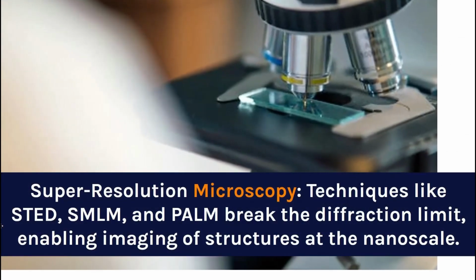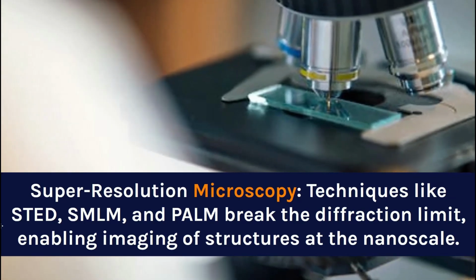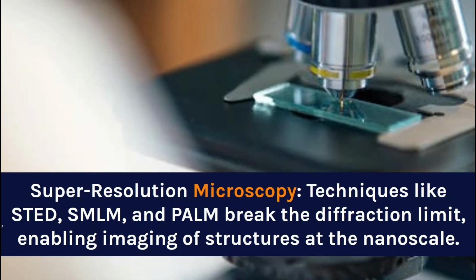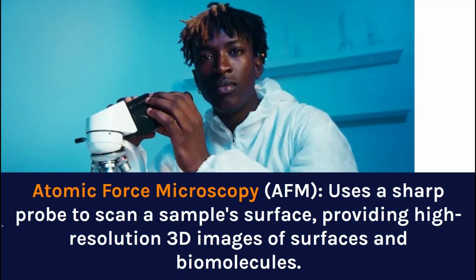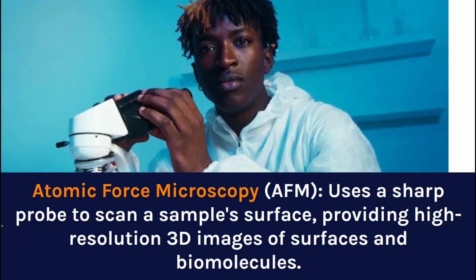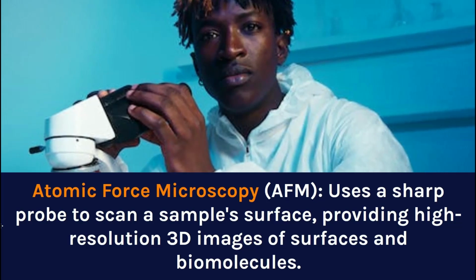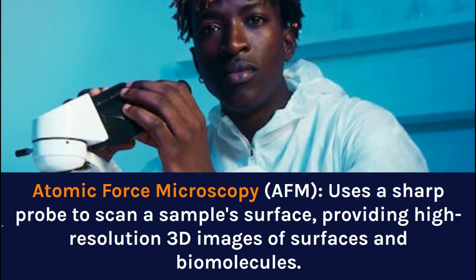Super-resolution microscopy techniques like STED, SMLM, and PALM break the diffraction limit, enabling imaging of structures at the nanoscale. Atomic force microscopy, AFM, uses a sharp probe to scan a sample surface, providing high-resolution 3D images of surfaces and biomolecules.